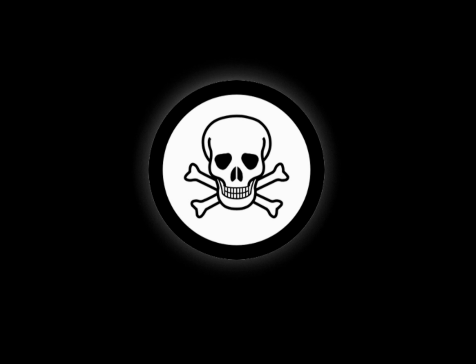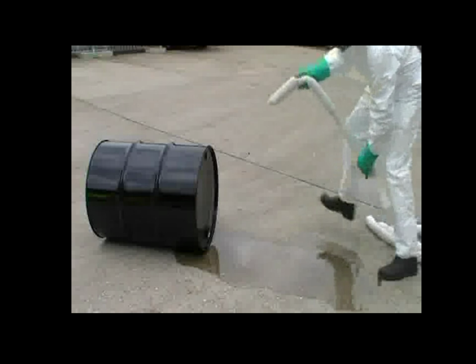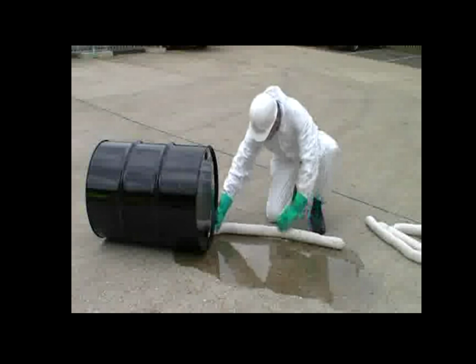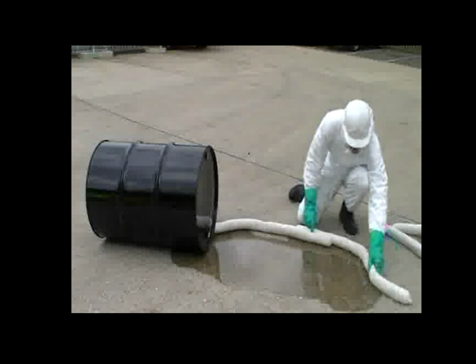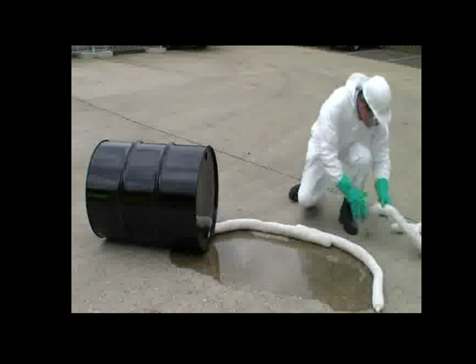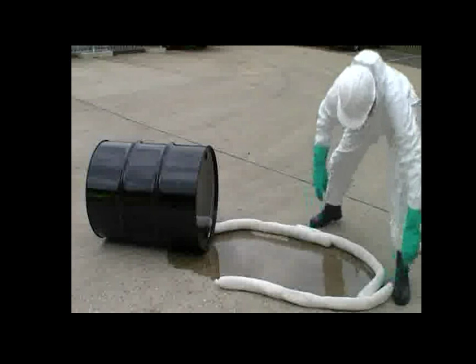Look at this well-known symbol. This means that the material may be potentially fatal if inhaled, swallowed, or makes contact with skin. May cause permanent damage if inhaled, swallowed, or makes contact with skin. May burn eyes or skin upon contact. Therefore, you should handle the material with extreme caution.